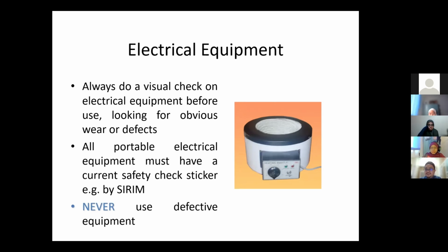This is a challenge these days because people like to buy things online, from Shopee, from Lazada. They give you nice discounts, free shipping vouchers, etc. And you can buy directly from China, and then these equipments are not checked. We don't really allow people to bring other equipments into the lab.